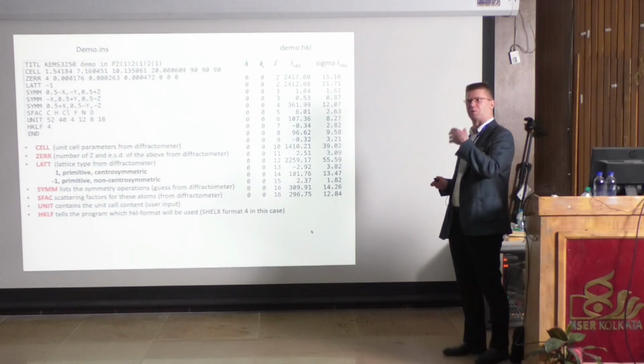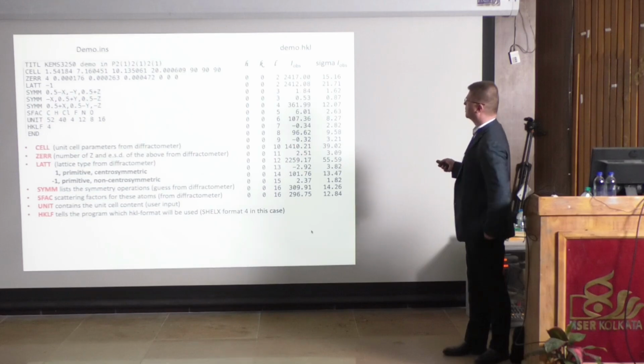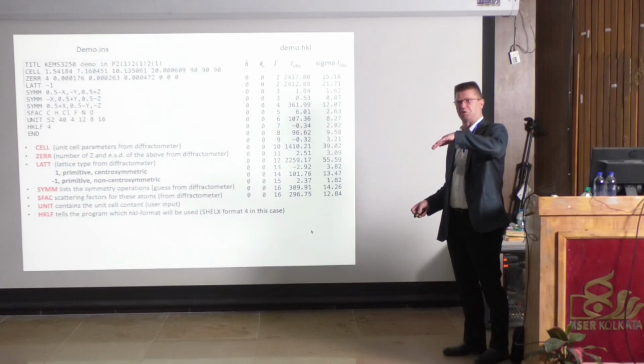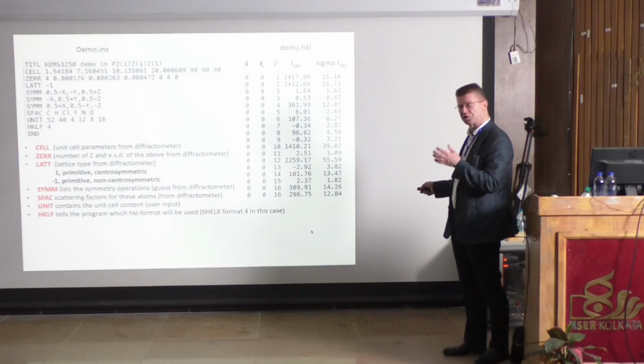Earlier we had to do this by hand, and go through each of them and see ourselves. And you can see now that 4 is a big number, 6 is a big number, 8 is a big number, 10, 12, and so on. But you can see there's variations. What this means is that if you look for this number, 0012, there is a lot of information coming. So the intensity is high. That means that there has to be a lot of electrons on that plane. And in here, that's much less. There's virtually nothing, but still there.